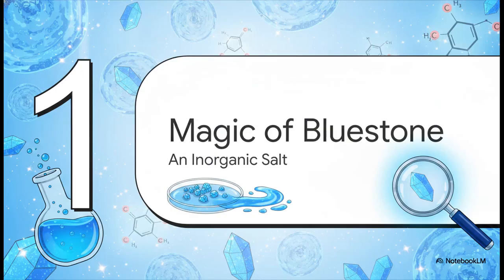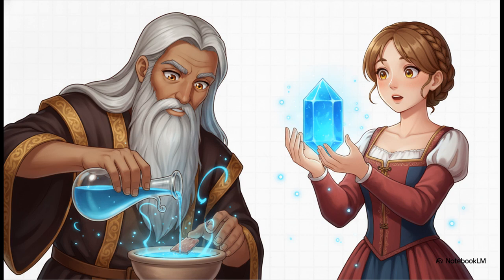All right, let's start with Section 1, the magic of bluestone, and look at the basic identity of what we're actually dealing with here. Throughout history, humans have been totally captivated by this inorganic salt. It's generated by reacting sulfuric acid with copper, and it has gone by some pretty highly descriptive names over the centuries. You might see it referred to as blue vitriol, Roman vitriol, the vitriol of copper, or simply just bluestone. And most of these historical names highlight its striking appearance, right? Which has made it stand out to chemists and artisans alike for generations.